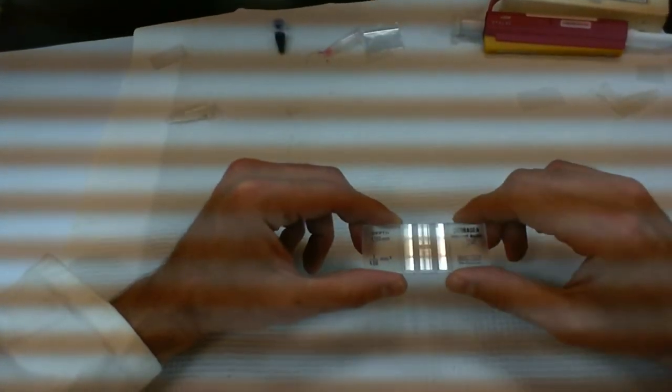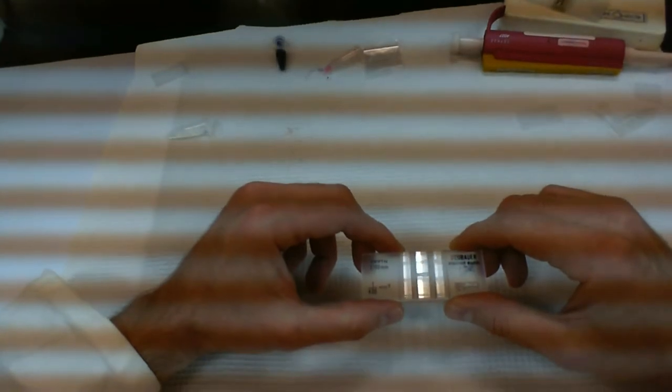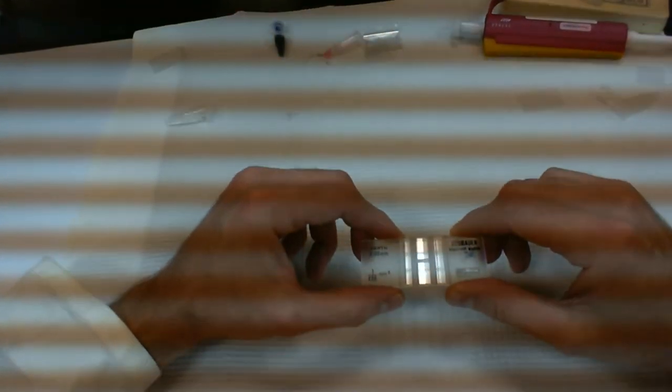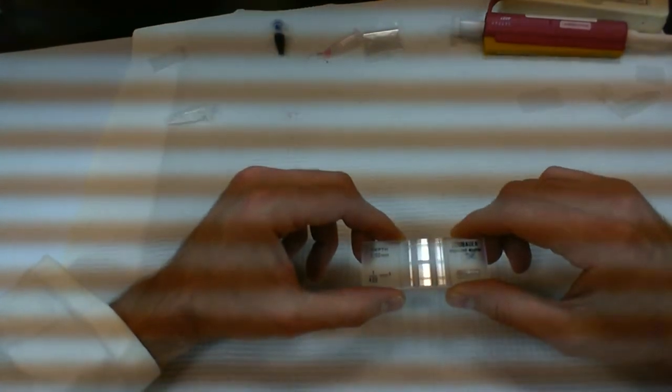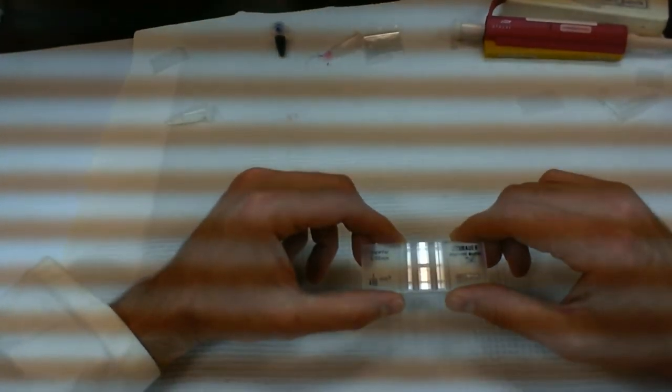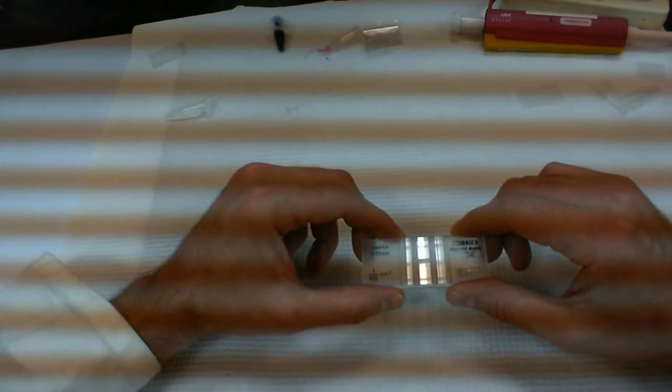Basically what that means is that we have some etched glass in those regions that have a grid, and so when we put our sample of cells in there, they will be spread across that grid, and we'll be able to use that grid to help us count these cells.